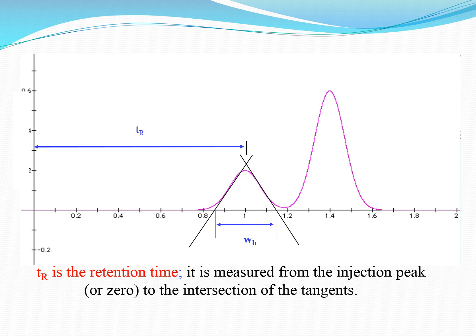Now, a very important thing to know is the TR time. The TR is the retention time, which is the time between the injection and the peak of the signal. The center of the injection, or the zero, and the highest point or the peak of the triangle or the curved drawing. Each material or substance has its own TR time or retention time. By knowing this retention time for different materials, we can know what the material is made of, or the components of the material.